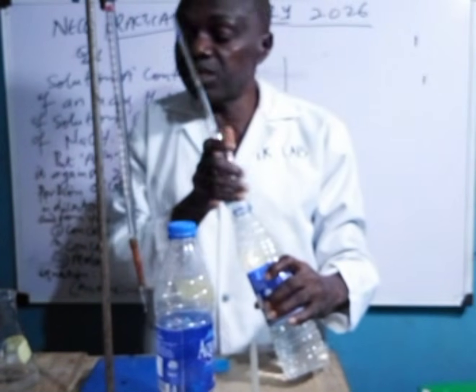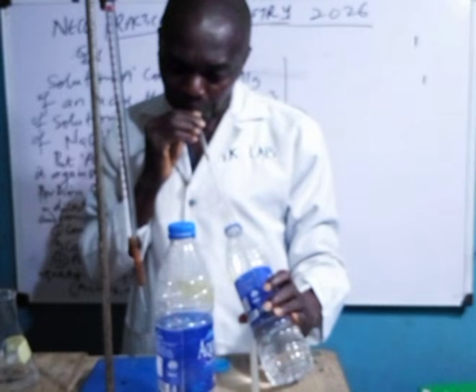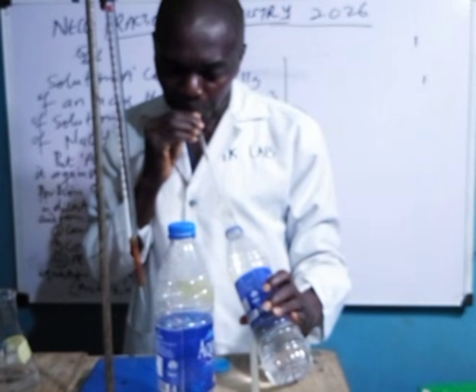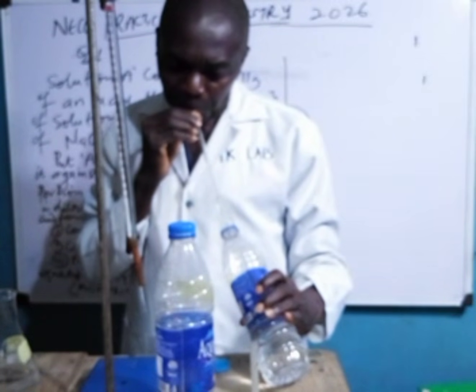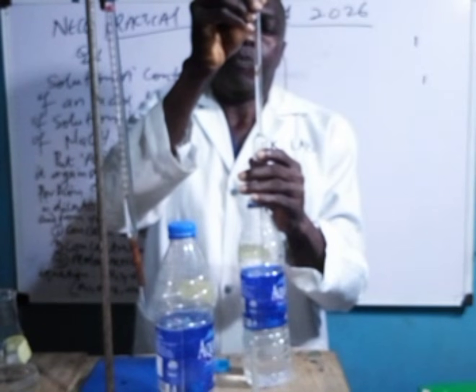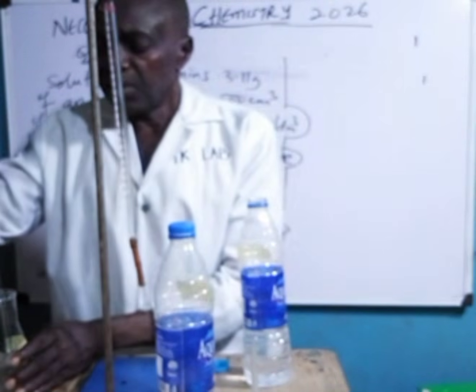You cannot use a measuring cylinder, you know that. Okay, so exactly at 25 cm cube. Allow it to drain through.